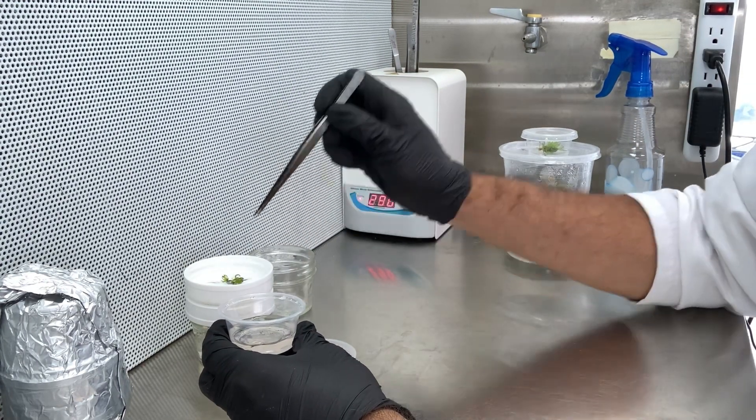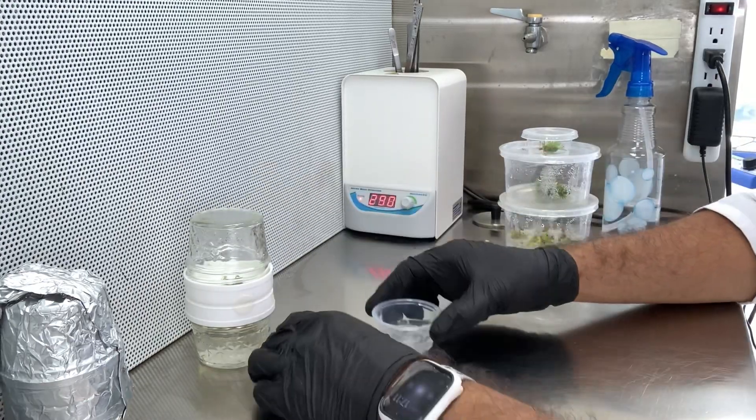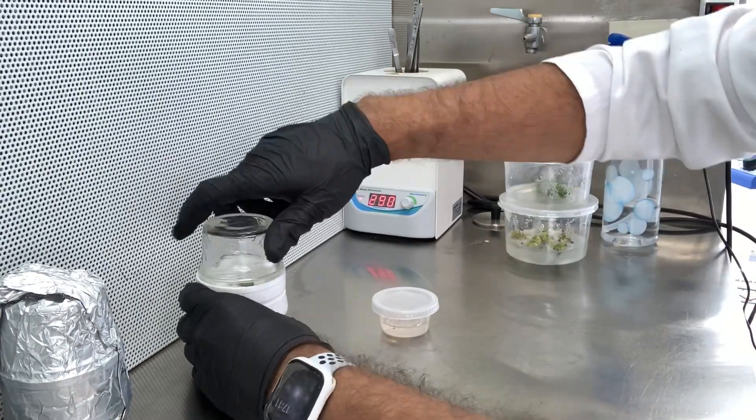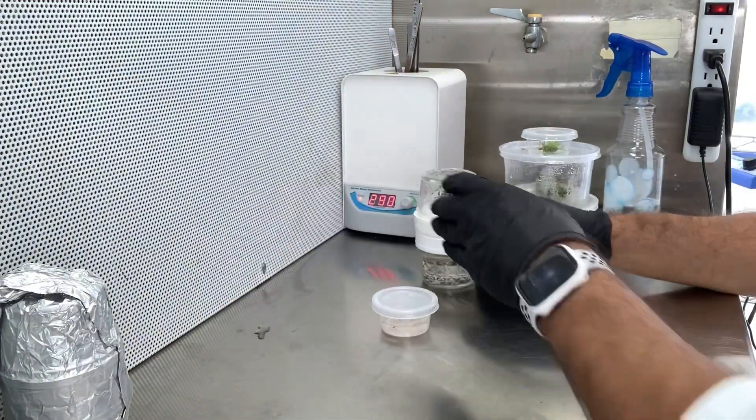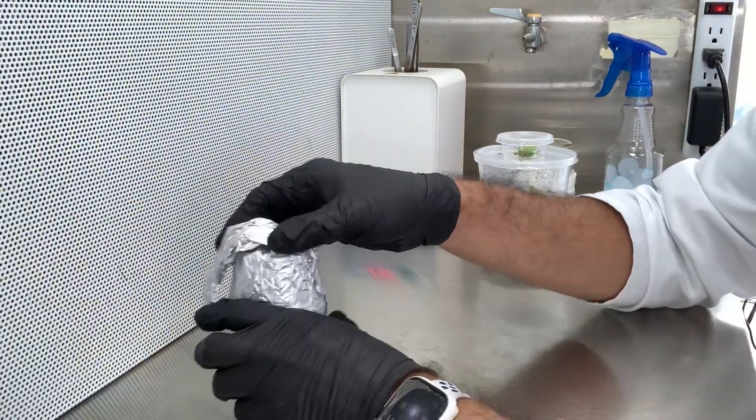How to use the biocoupler Temporary Immersion Bioreactor? All you have to do is tilt the bioreactor as needed, once a day or maybe just once a week, depending on the plant and speed of growth.